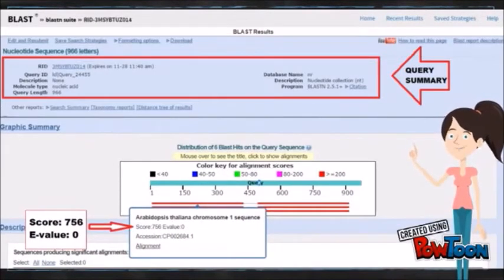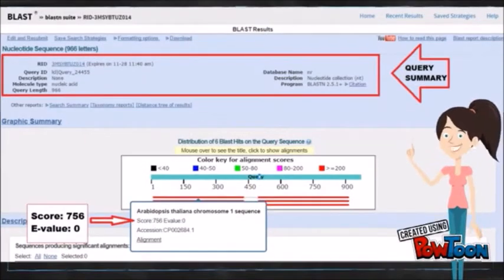Score is a number used to assess the biological relevance of a finding. In the context of sequence alignments, a score is a numerical value that describes the overall quality of an alignment. Higher numbers correspond to higher similarity. While the expect value is a parameter that describes the number of hits one can expect to see by chance when searching a database of a particular size, the lower the e-value, or the closer it is to zero, the more significant the match is. However, keep in mind that virtually identical short alignments have relatively high e-values.